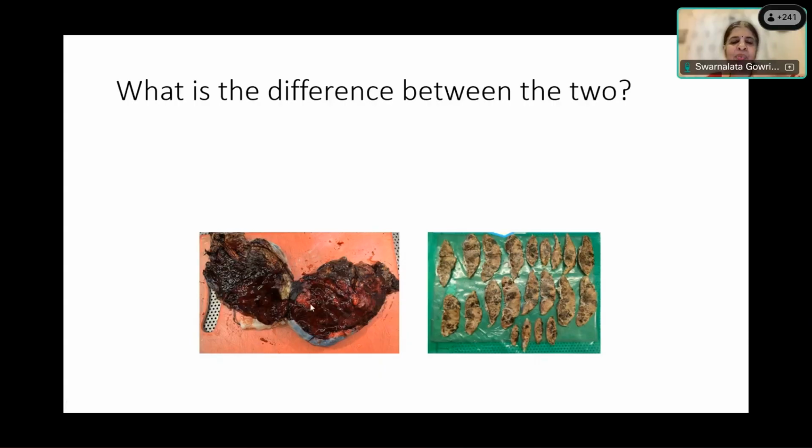So when you have so much of hemorrhage, the important artifact that you will get is formalin pigment. Formalin pigment happens at acidic pH and in formalin. So this is one of the main reasons, because we don't want formalin pigment, because it will really interfere in your tissue. So if you look at hemorrhagic sections of say a spleen or anywhere else, and you find this brown pigment just lying there, you will know that it's formalin pigment, and you can say that that lab has probably not used buffered formalin.